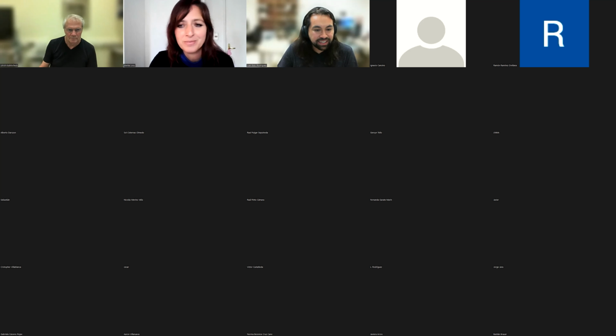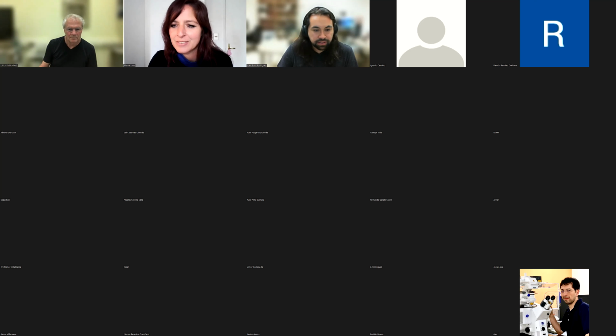I think we have some information from Ignacio at Microx Chile about some mesoscale accessories for larger scale sizes. Yeah. Extra magnification.